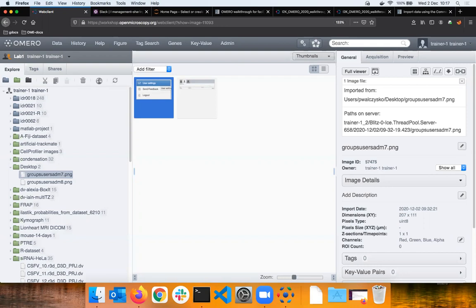Okay, cool. That's what I was asking. Yeah, because in that case, if you have already done some annotation on that image, you don't want to repeat all that work. That was my thought exactly. Yeah, but we have already worked on it. We don't have time to show you everything, but we have mechanisms to copy knowledge from one image to the other, change ownership, and change group. You can do quite a significant amount of things afterwards.